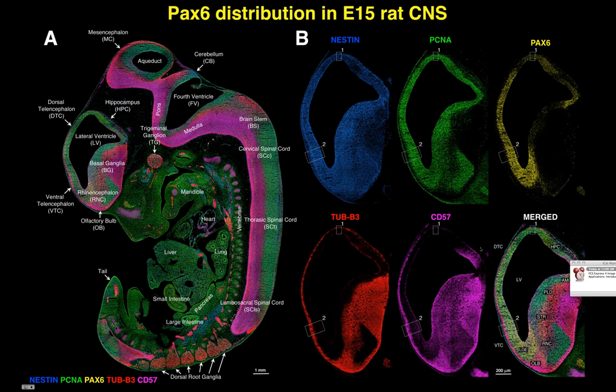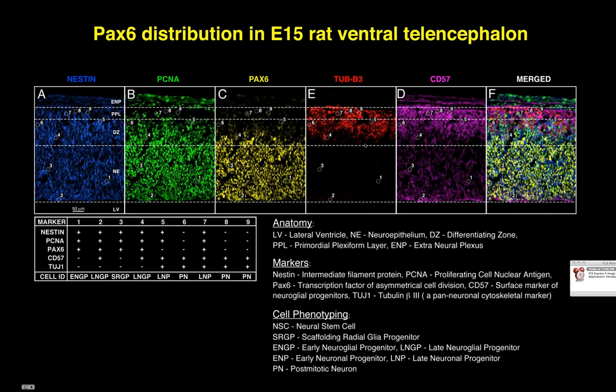So, given that all of this tissue patterning is very dynamic and complicated, one of the ways to address this complexity and get insight into how this tissue patterning is forming at the beginning of neurogenesis in this rat embryo is this: the old way was to take individual images, draw little regions of interest, and then correlate markers, like cell number 7 has nestin, it's PCNA positive, it has PAX6, but it's not a neuron yet, it's a progenitor.